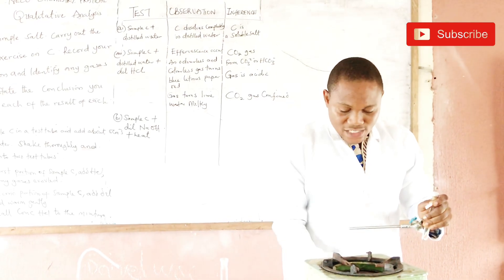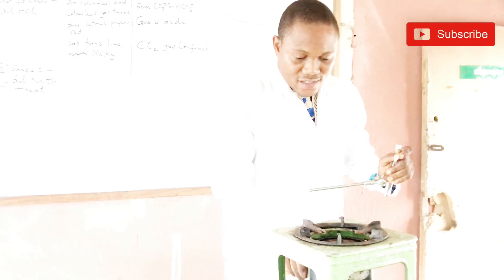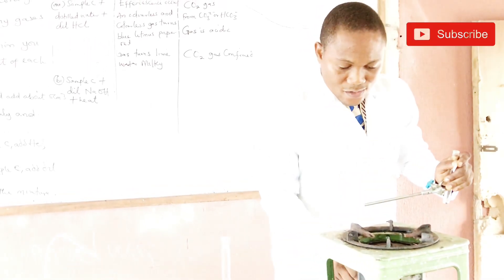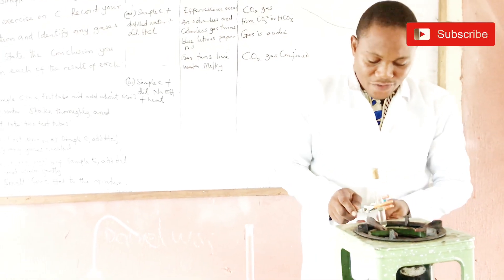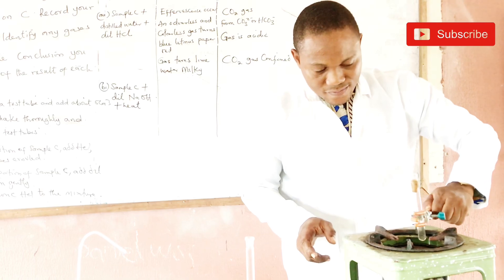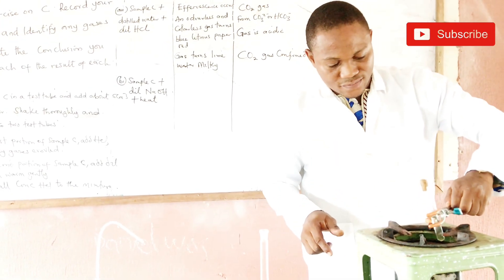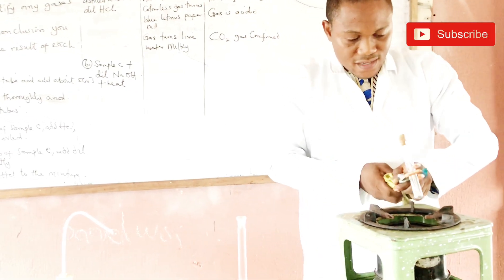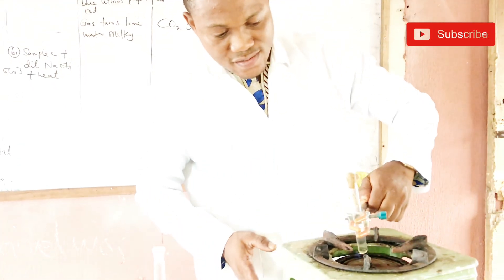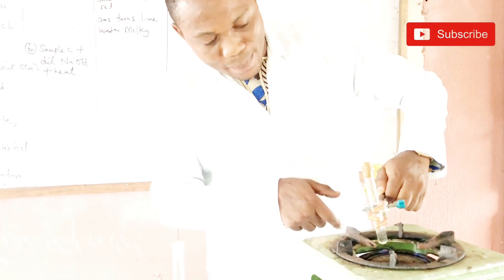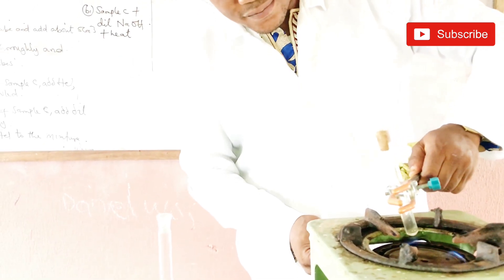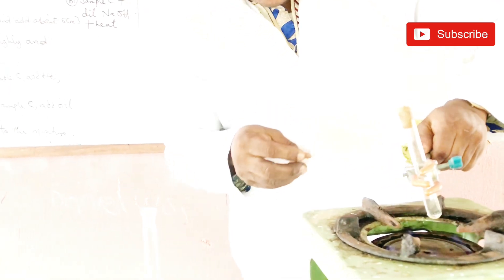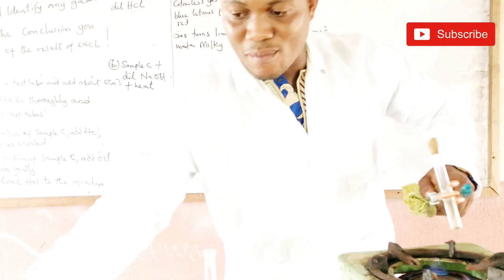I'm using the stove as a source of heat. Heating gently — if you look at it, you can see bubbling in the liquid. When I see bubbling in the liquid, it means a gas is evolved. I can test the evolved gas with my litmus paper. Look at the bubbling — that's the evolution of gas. I moisten my litmus paper.